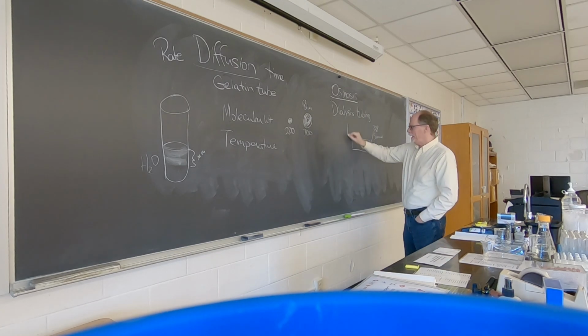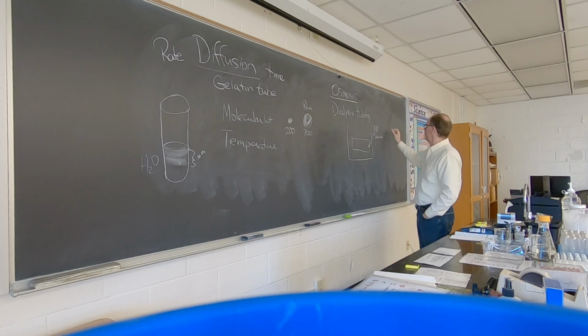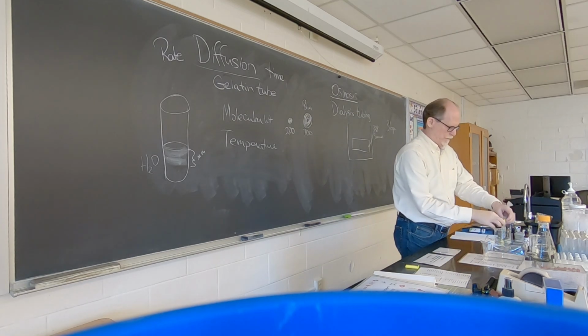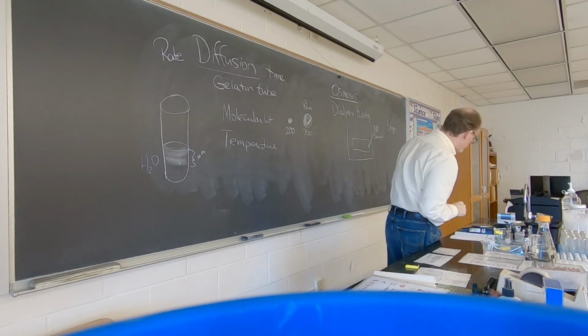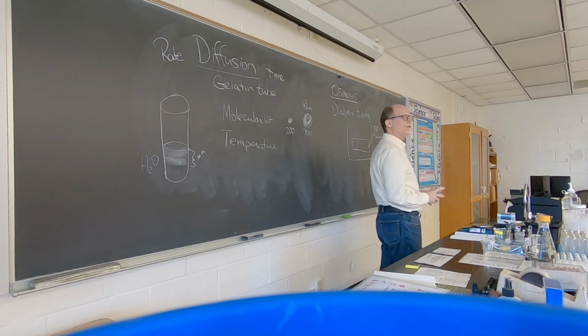And then the bag, after I weigh it, weighs 36 grams. This morning it went up by a gram. And I'm going to put it in some water. And then I'll reweigh it and see what happens, okay?